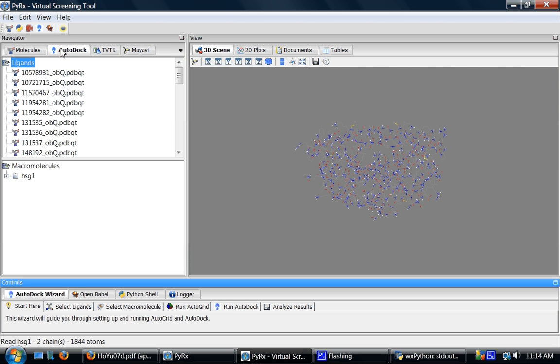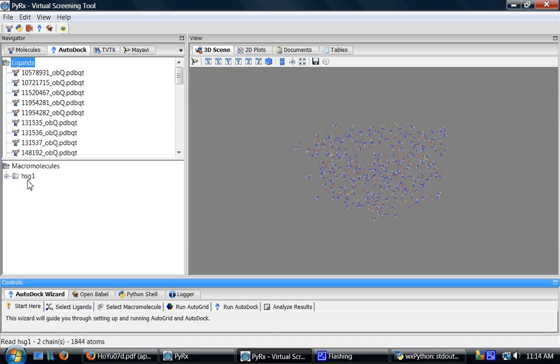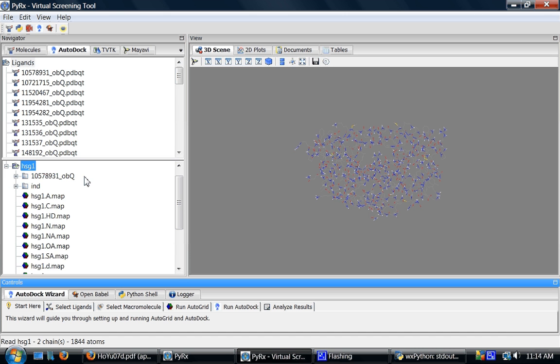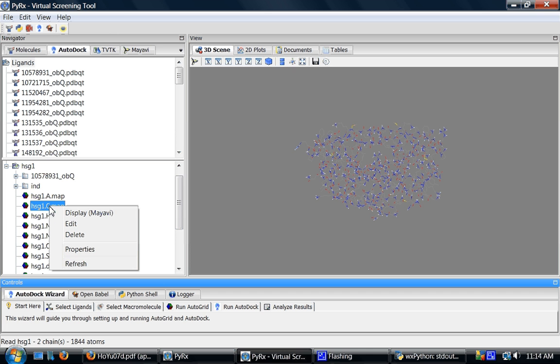I'll go to AutoDoc tab and here if you followed along with the first screencast you'll have under macromolecules a folder called HSG1 which contains among other things AutoGrid maps. And here I'll select carbon atom map and right click on it and choose display MayAVI or you can just double click on it.